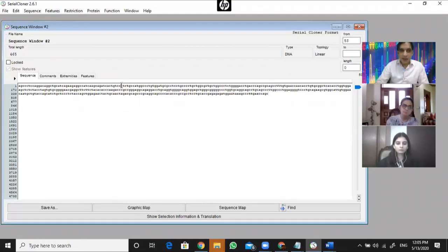If I select certain other portion like this, here I can see I am selecting from base pair 53 to base pair number 82, and the region I have selected is 30 base pair length. So whenever you select certain portion, it will help you to know from where you are starting and where you are ending. Remember, Word doesn't have any idea about all these things. It's just a way to keep the record of a sequence, that's all, not the base pair numbers. And it is not taking it as a DNA sequence. This software is taking that sequence as a DNA sequence.